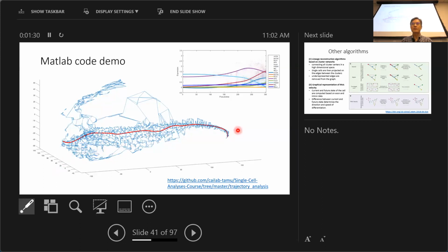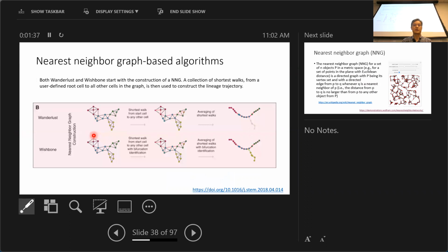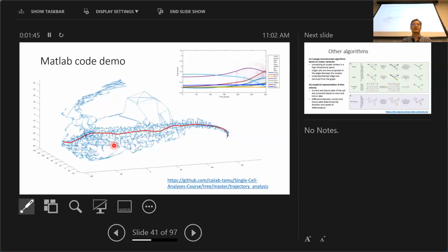Okay. So this is just like a mini version of the package I described here, not here. So this one here. To create a KNN network and then make a trajectory and then assign cells which are close to any time points, just assign a pseudotime for all the cells. But there are some problems if you have cells which go this way. I probably should have another analysis to go from this branch.